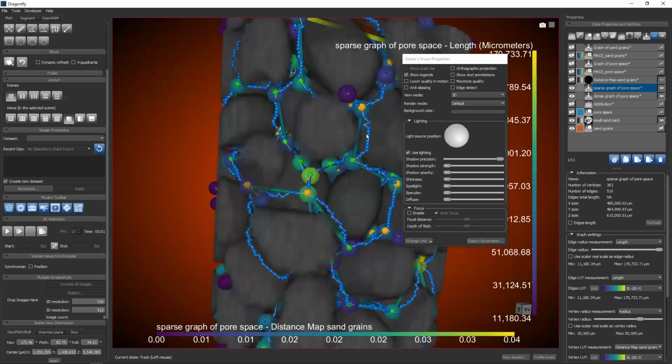Next question, is it possible to simulate fluid flow using these pore spaces? So yes, if you're using the OpenPNM tools. I don't know how to use them yet, but we can get together some documentation on how to do that. If you want to do pore network modeling and you want to do, as I mentioned, single phase or absolute permeability measurements, you can do that. There's all sorts of people who have done this in the literature using pore network models to simulate fluid flow. For some samples, it's a very good simulation. For others, the pore network model may be too much of an abstraction, but it's computationally cheaper than a lot of the more complicated simulations.